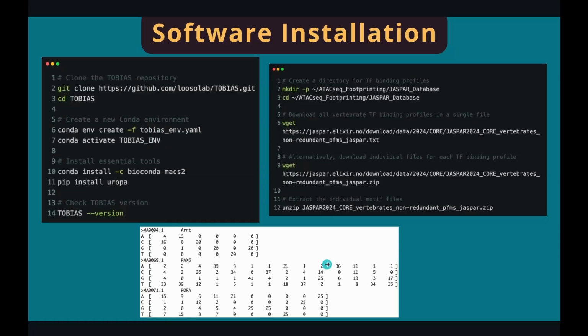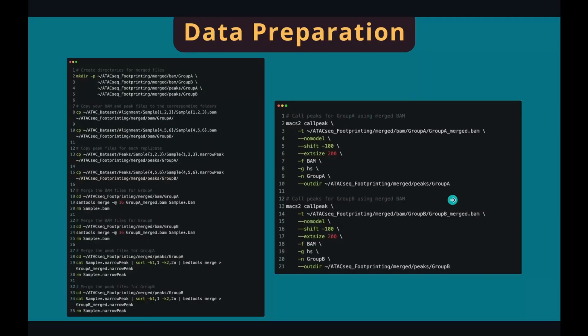If you don't understand, don't worry about it. This file is not for you to read. It's for the TOBIAS tool. Next, let's prepare our input data for TOBIAS. The code here looks complicated, but don't get scared yet.